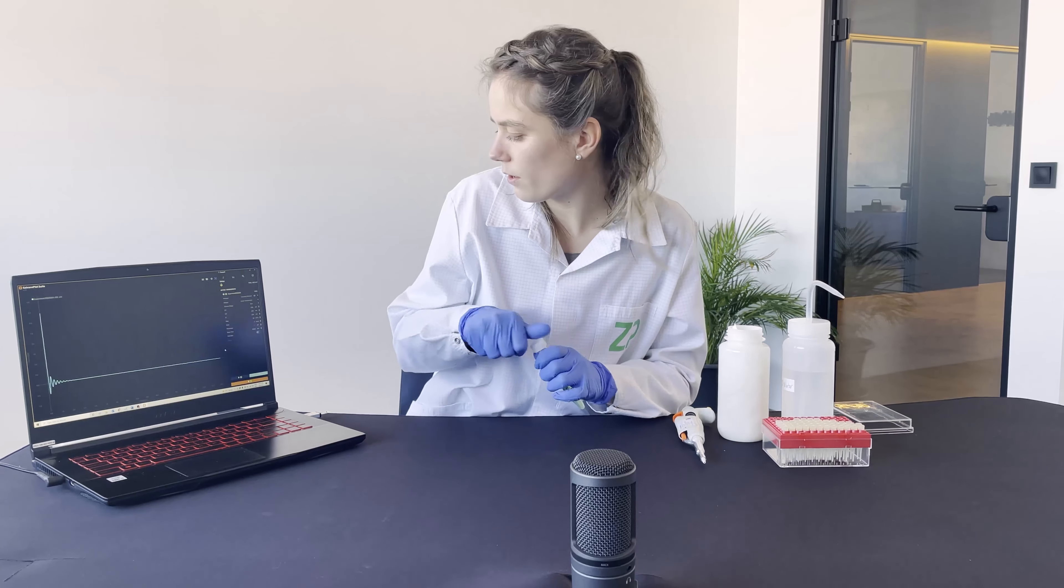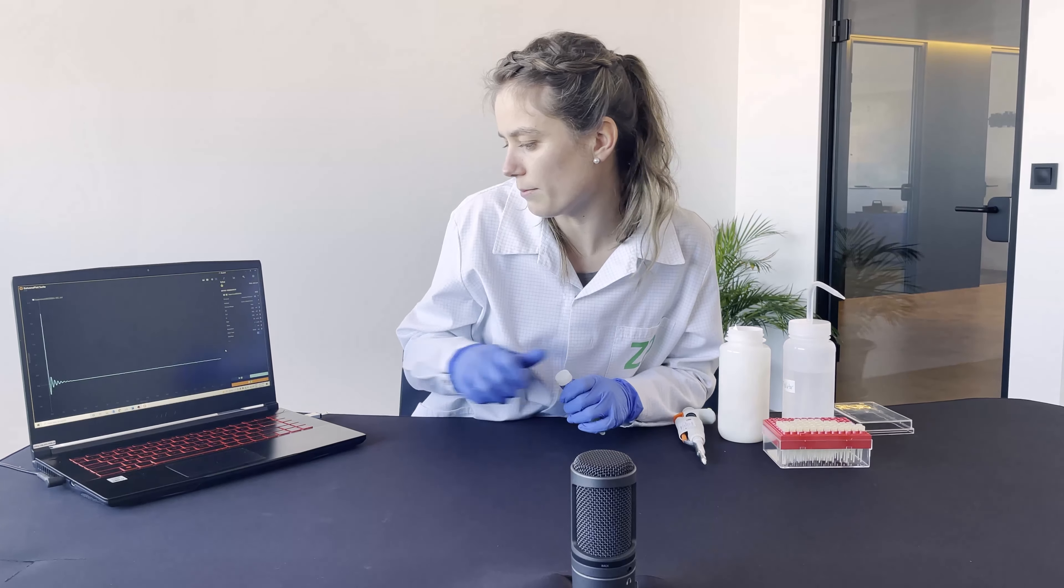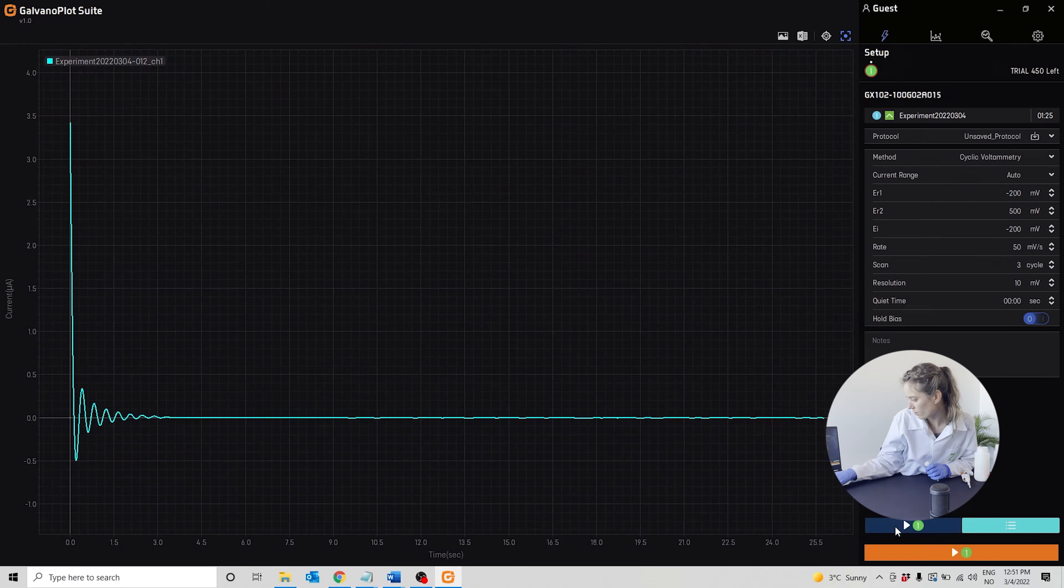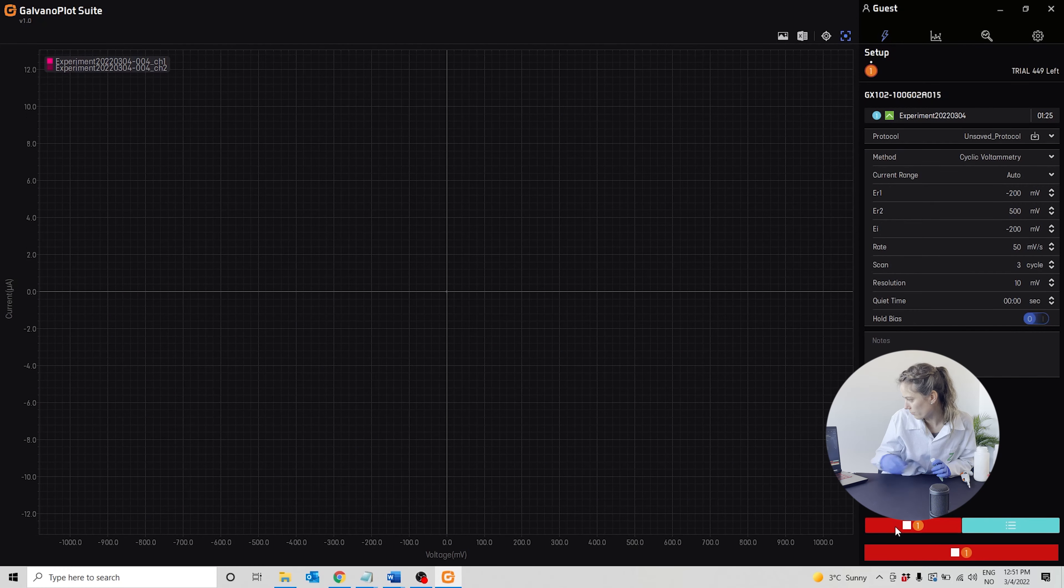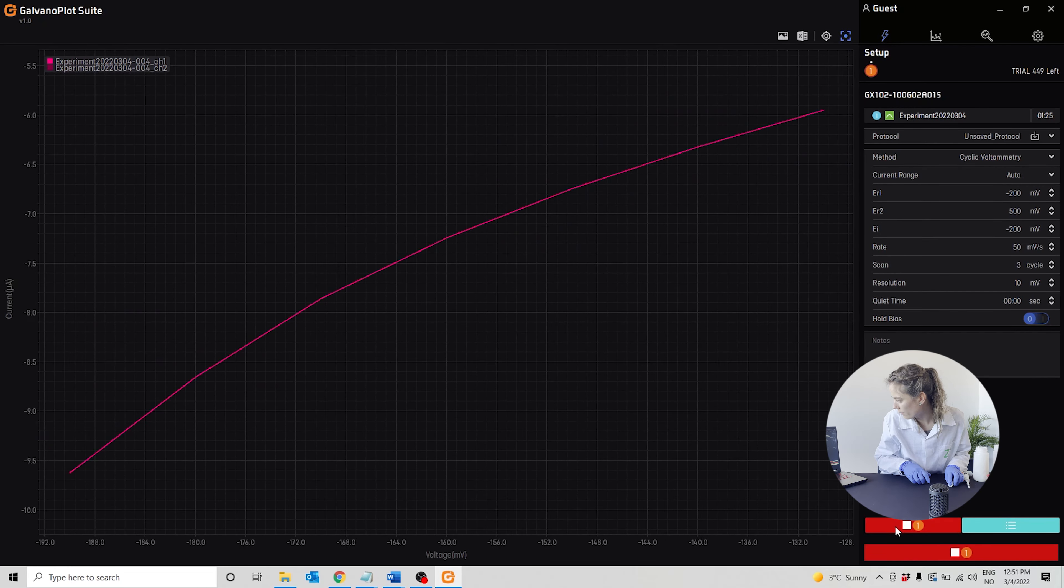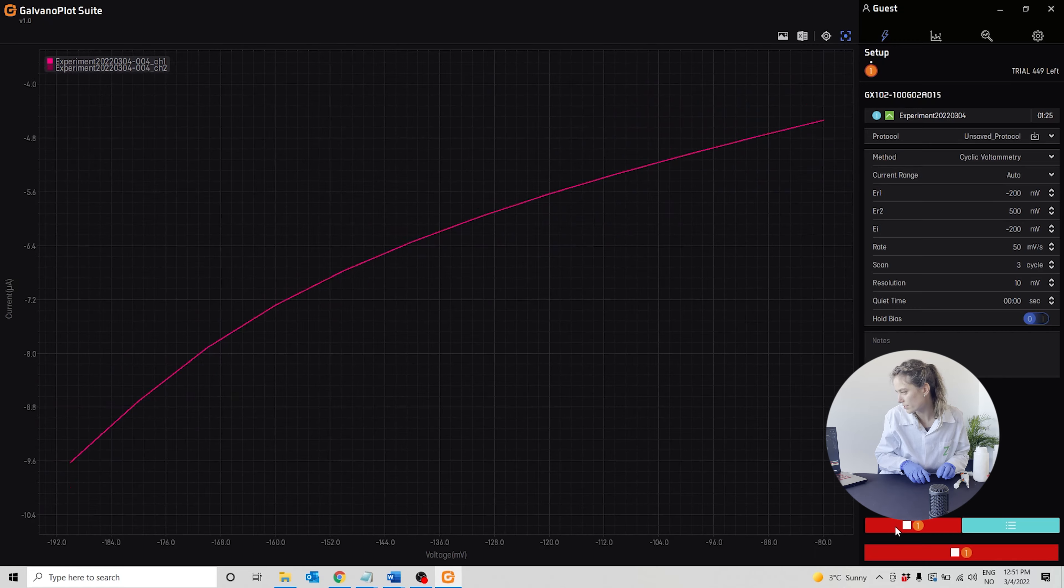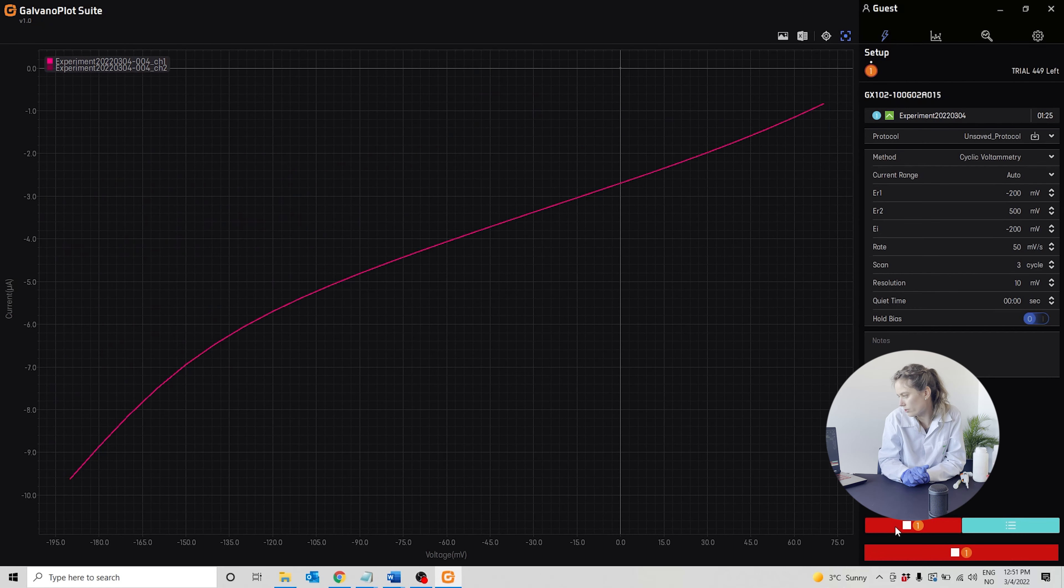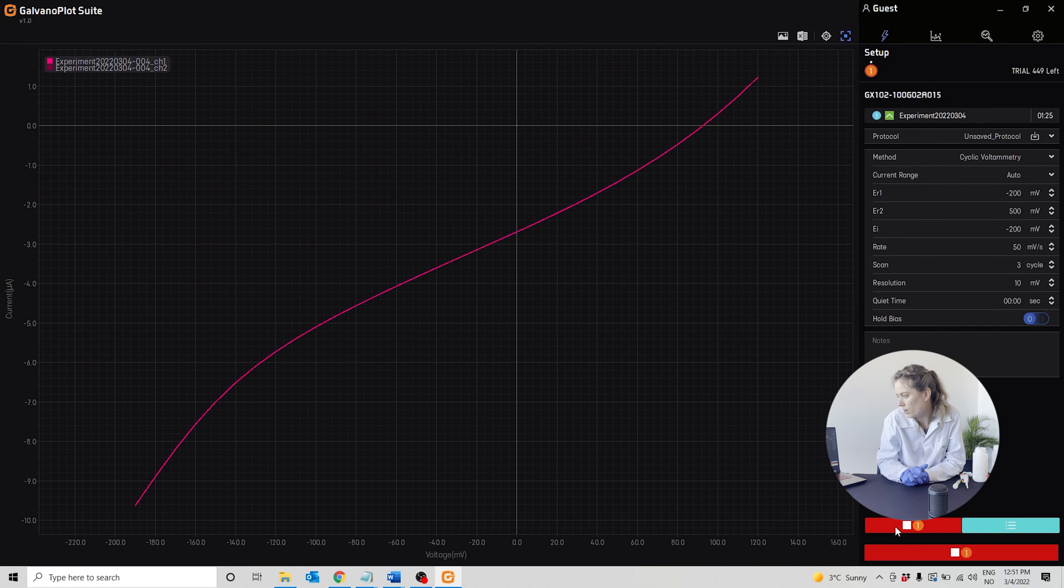We will now start the measurement. We'll hit run, and you can see that the cyclic voltammetry curve is starting to form.